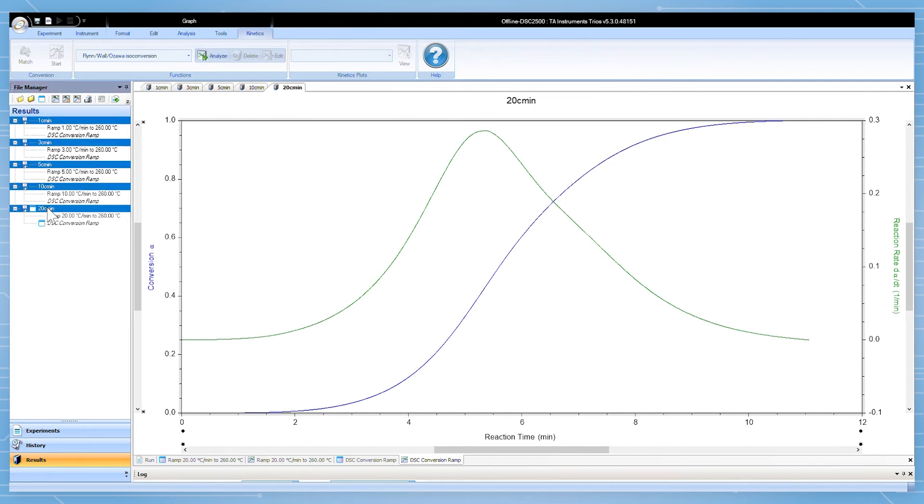This data was collected at five different heating rates from 1 degree Celsius per minute to 20 degrees Celsius per minute, so we will use the Flynn-Wall-Ozawa dynamic heating rate model. The software will recognize the types of files highlighted and only allow the appropriate model to be selected.